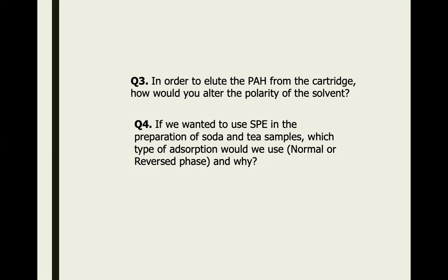If we wanted to use SPE in the preparation of soda and tea samples, which type of adsorbent would we use, normal or reverse phase? I think you can guess, because it depends on whether you have aqueous samples, what kind of compounds you wish to take out, or what kind of interference you want to remove. You have to match them with the suitable technique.